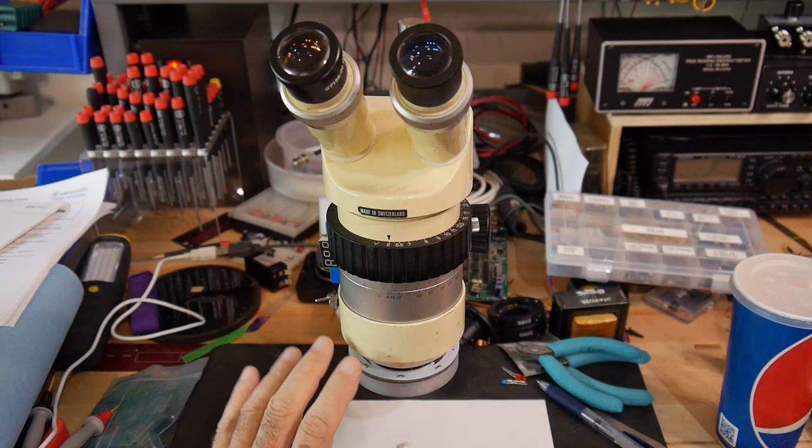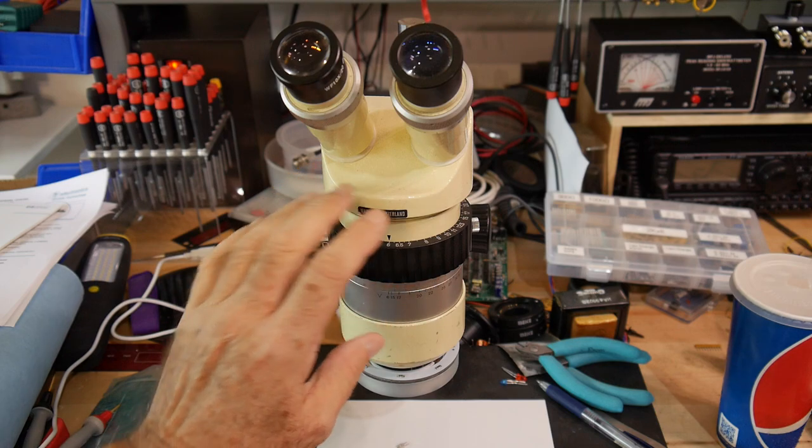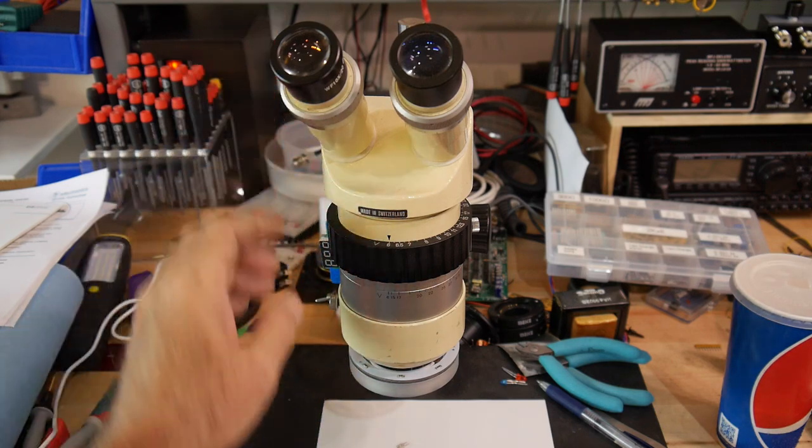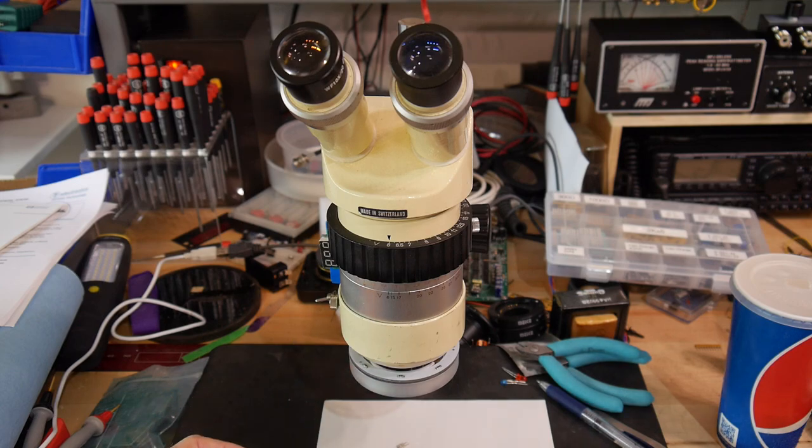I thought I'd show you a hack I did on my microscope. It's a nice stereo microscope. It didn't have a ring light though. In the old days, I used to get ring lights that were a little fluorescent tube that wrapped around. But you can get LED ring lights these days, and I'll show you a cheap way to do that.